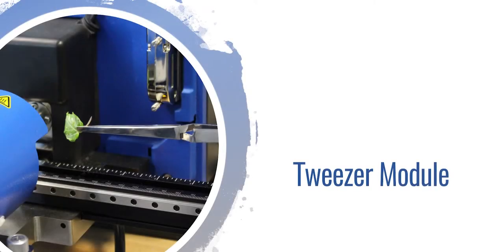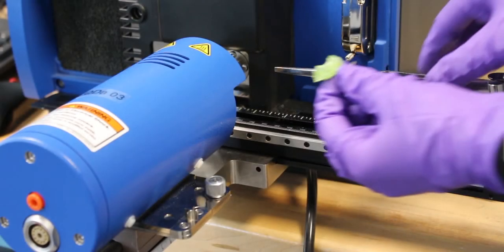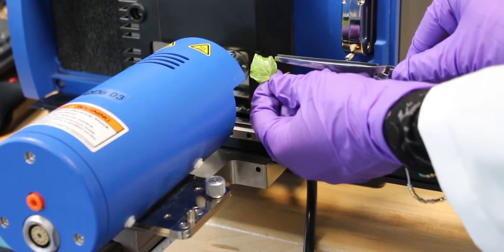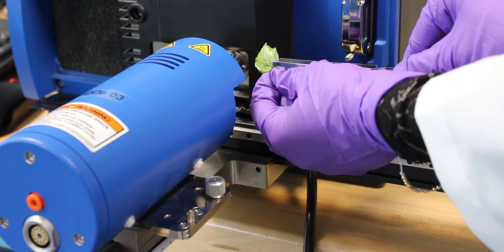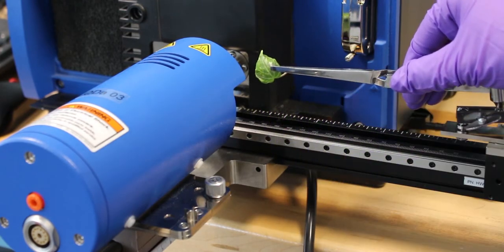If the sample is an irregularly shaped object or solid, such as a plant, fruit peel, or dollar bill, the tweezer module is a convenient way to introduce the solid into the DART stream in a more steady and reproducible way.